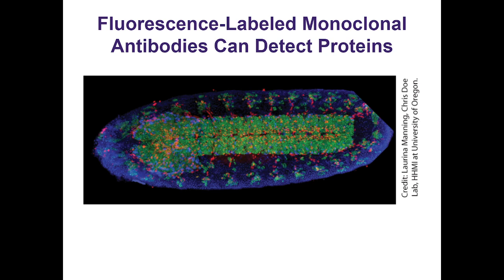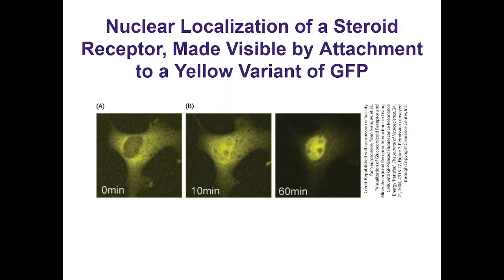This right here is actually fluorescently labeled monoclonal antibodies, what we're looking at right here. And you can sort of see how this works out. Now keep in mind that oftentimes this is not what you would see directly with your eyes, okay? This is usually a non-visible light that you would see, or light that you couldn't actually differentiate. And then you have a computer program that's highlighting sections, okay? You normally would not be able to see that sort of gradient, really fine, lots of different colors with your eyes in a microscope, okay?